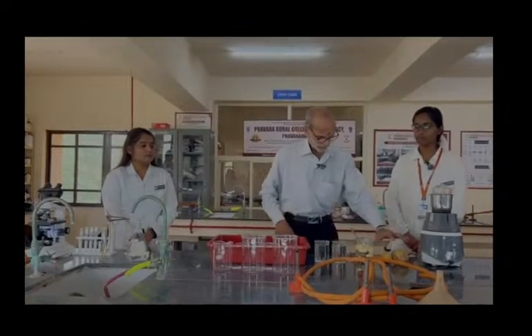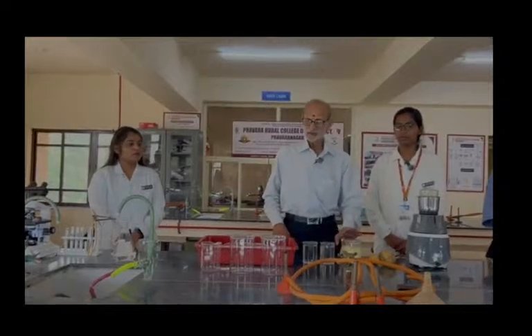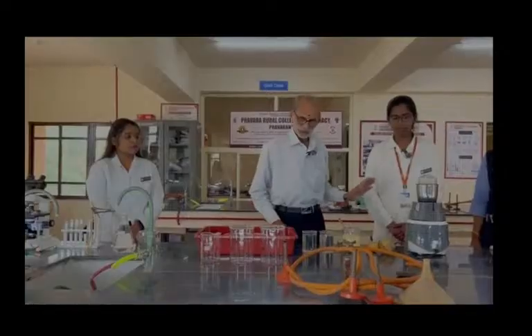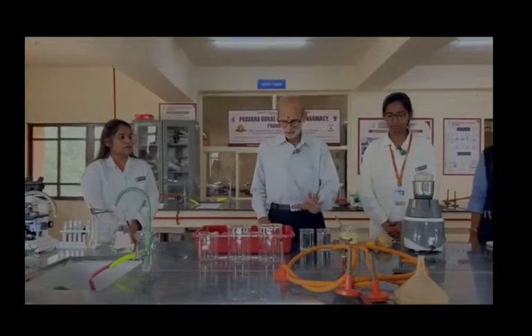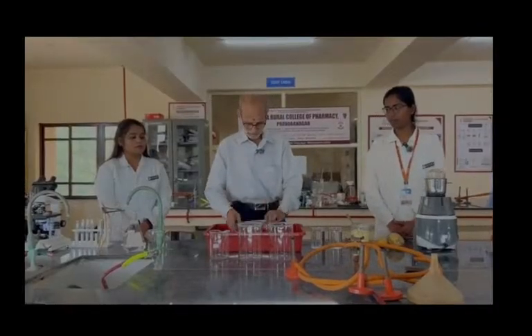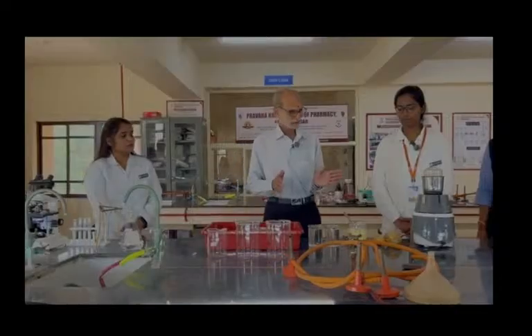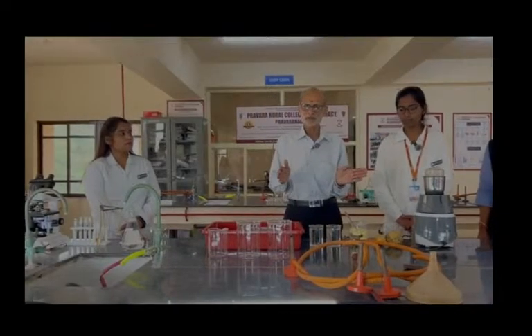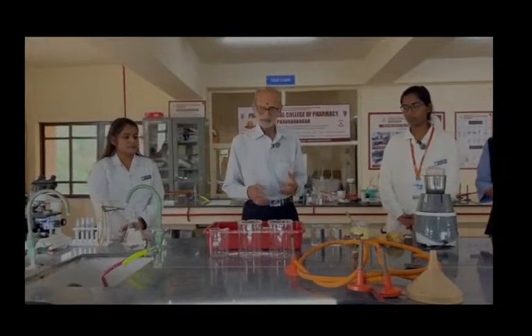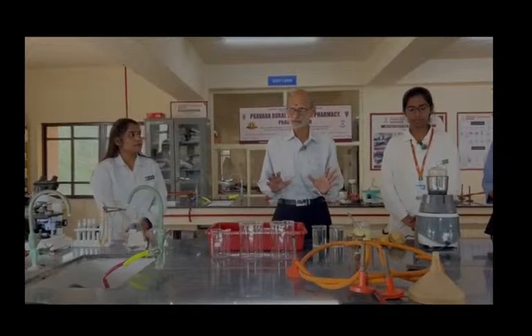And here we have a potato, and these are the peeled potato pieces. What we are going to do is make a pulp in a mixer. Bhakti is going to do that, and thereafter we'll be passing it through the mesh. The mesh which we are using is about 60 mesh, and the starch grain of the potato is up to 100 micron in diameter, so it will pass through, whereas the cellulosic material remains behind. Potato contains around 17% starch.